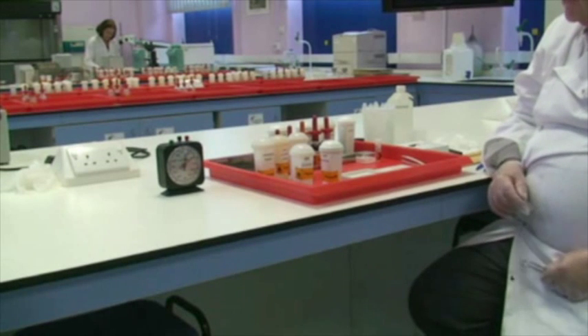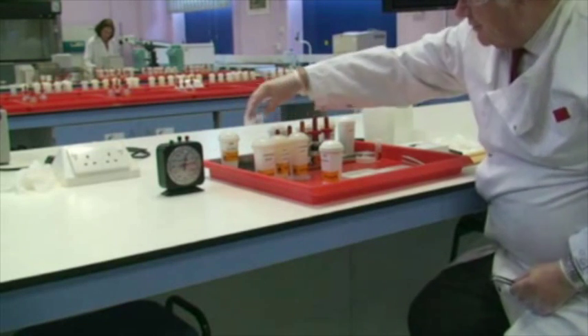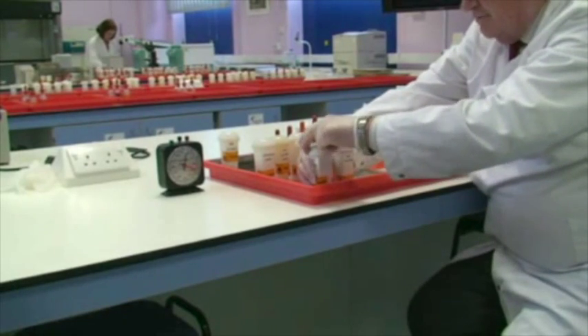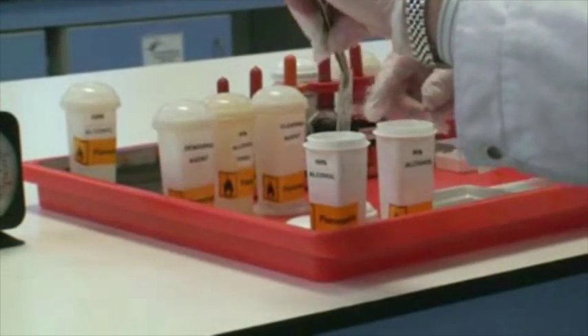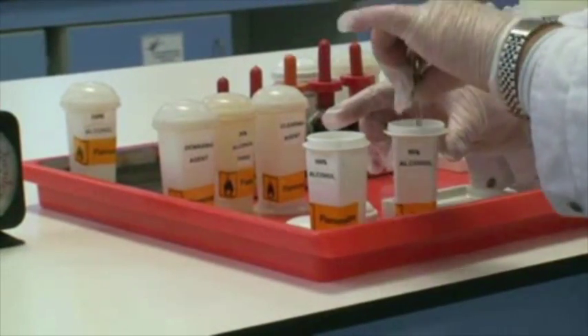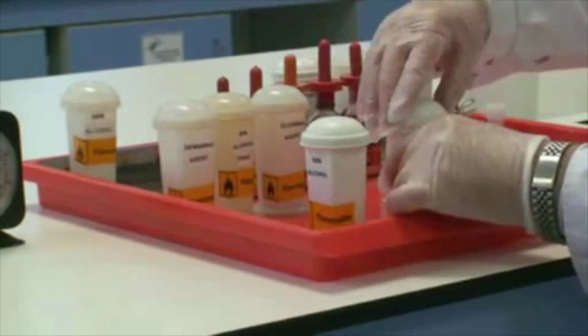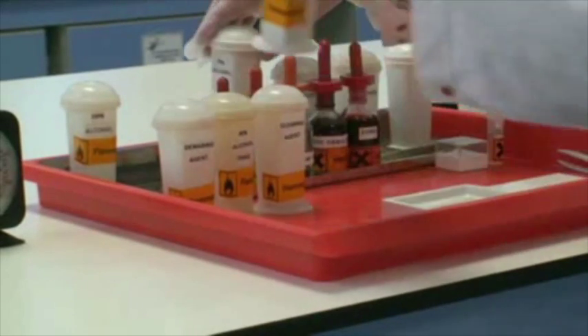Two minutes have passed, so we can now transfer our section across to the first of the 95% alcohols. We remove the lid and take our section into the 95% alcohol, then repeat the process of a further two minutes.